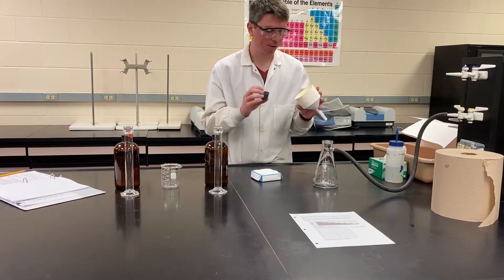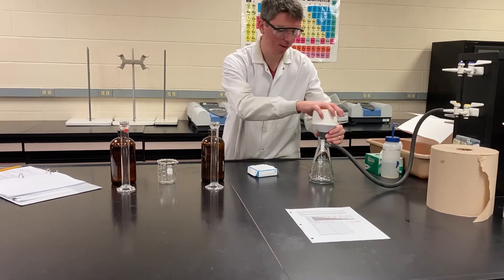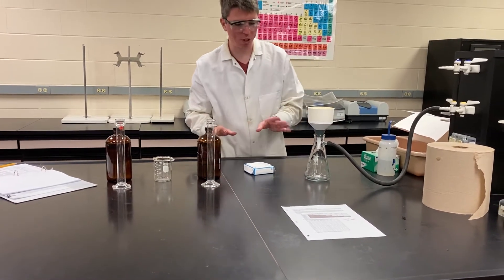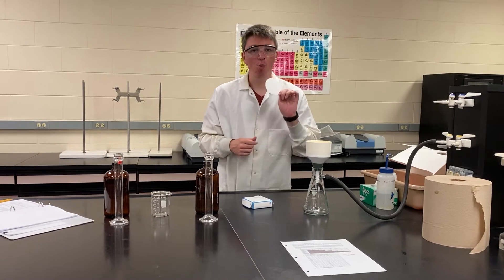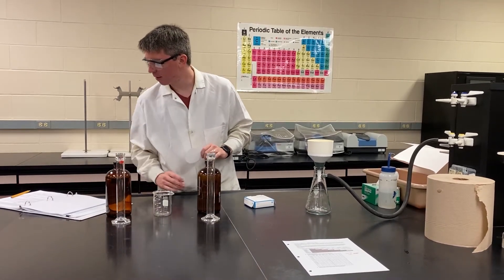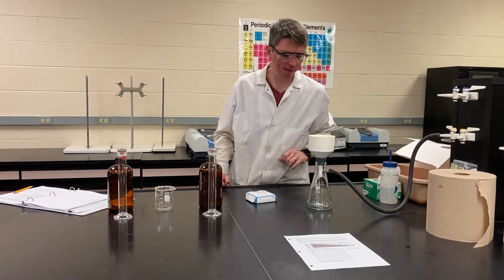Next thing we'll need is an actual funnel — this is called a Buchner funnel. There's a little vacuum adapter that helps seal the vacuum a little better; it just kind of sits on, you don't wedge it down or anything. We're going to need a filter paper to filter out the precipitate we're making. We do need the mass of the filter paper before we put it into our setup — I've already measured that out and it was 0.56 grams. So I'm going to go ahead and set that in.